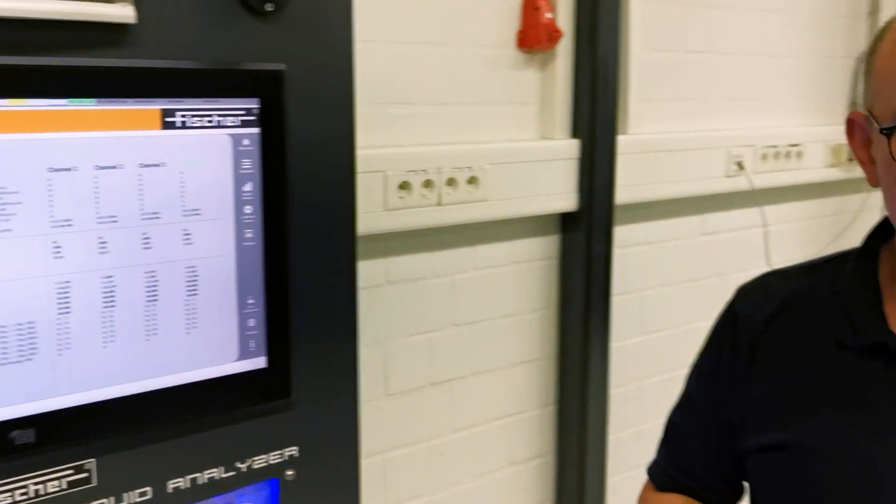This is designed to be super robust during operation—to automatically 24-7 measure your liquids, automatically purge and clean itself, automatically self-check (so-called reference, self-reference itself), and in case need be, self-calibrate itself.